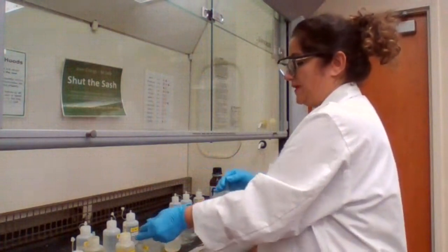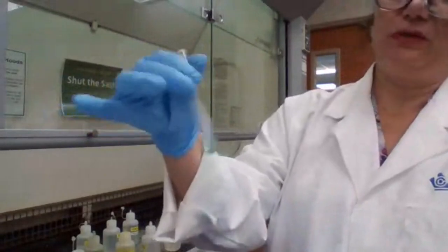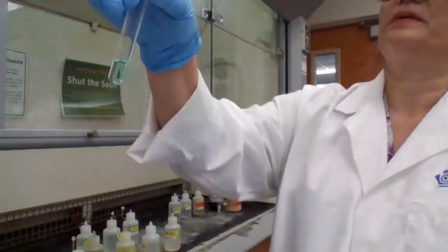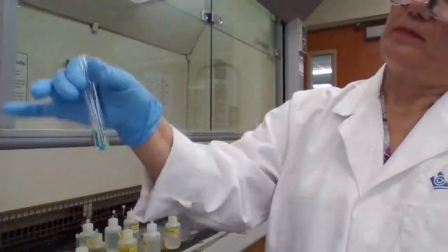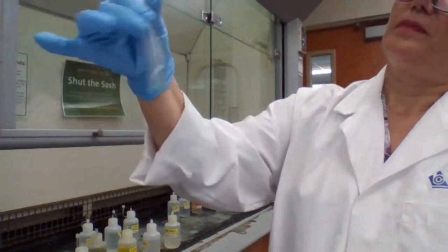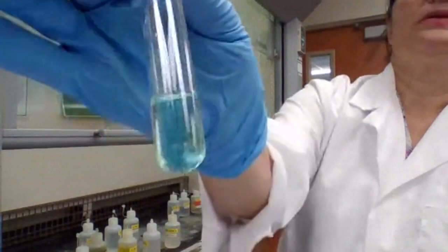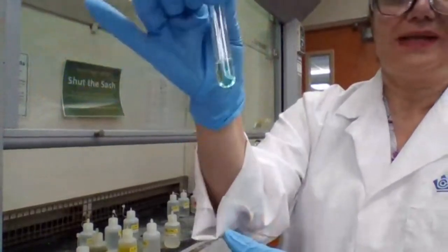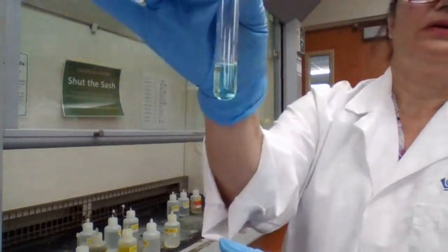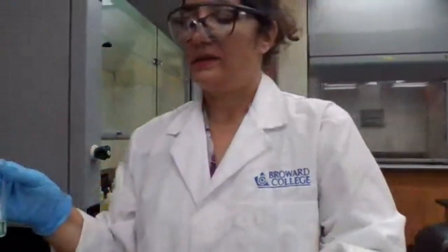Mix it well and wait for 1 minute. If there is a precipitate, you will see it form. If not, it will be all clear. There is no precipitate, it's all clear, so there is no lead. If I had a precipitate, I would centrifuge and separate it because I don't want lead sulfate to stay there.